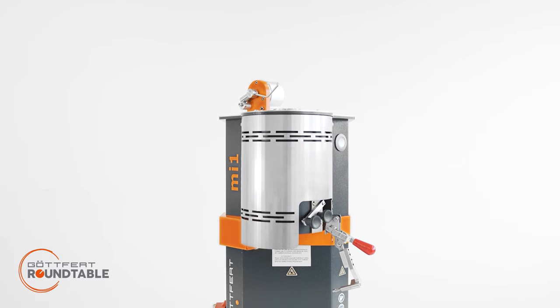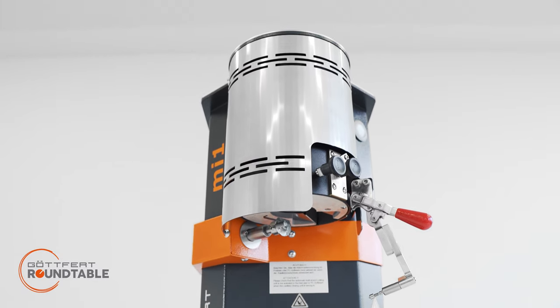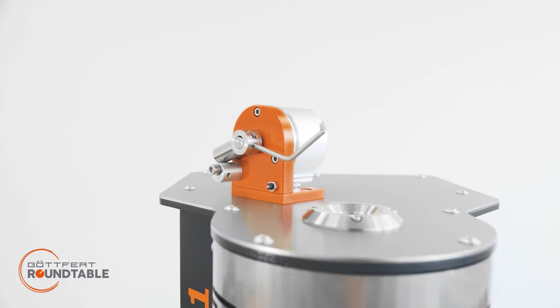MI1 is the most compact entry model for Meltflow Index testing. The instrument comes with high-end measurement relevant components with highest precision by using minimal automation modules. The instrument is a full feature and precise Meltflow Index tester.